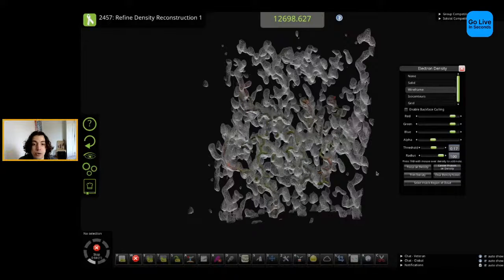The workflow that we picture for this new tool is an iterative process where you do your usual folding. But when you find that the density might be a limiting factor or there might be something incorrect about it, use that rephase button as a way of cleaning up the density in order to keep making progress. So I'm going to go back to, in this case, just wiggling because there are still clear issues with the backbone.